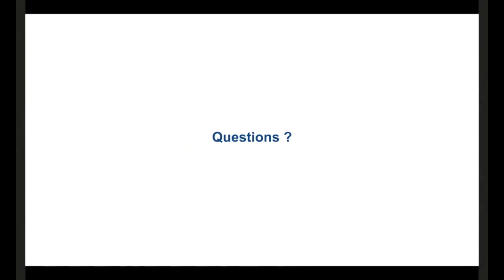Great, thank you very much, Jose Miguel. If you have questions, you can send them by chat. I can also unmute you and you can ask them directly. We had a couple that came in during the talk. One is a question about whether the Scipion streaming and processing session wizard has been installed in all the iNext TEM centers. I don't know what those are, but presumably you do.